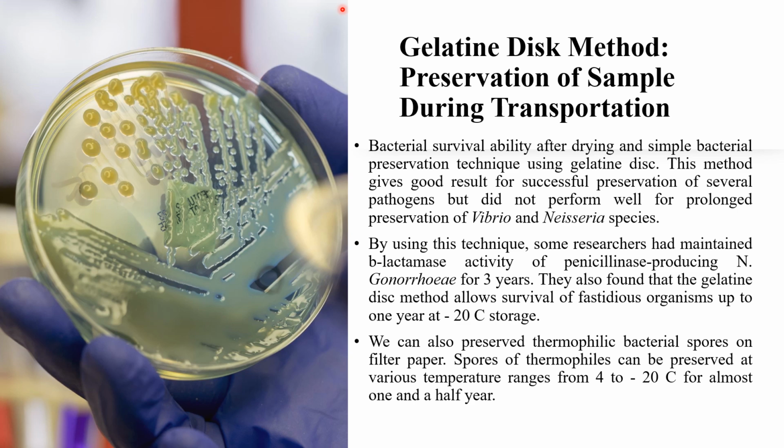So, studies examined bacterial survival ability after drying and a simple bacterial preservation technique using gelatin discs. This method gives good results for successful preservation of several pathogens but did not perform well for prolonged preservation of Vibrio cholerae and Neisseria species because these species are fastidious organisms, meaning they need some extra growth factors. Vibrio cholerae needs salt and Neisseria needs serum for growth.